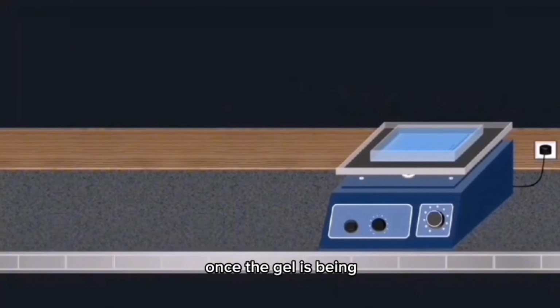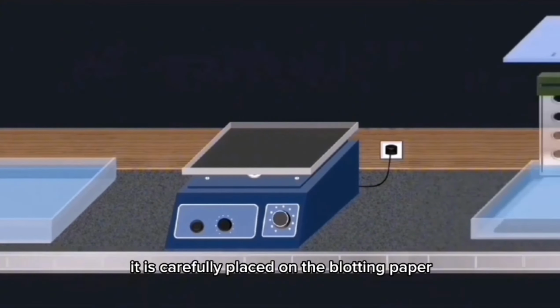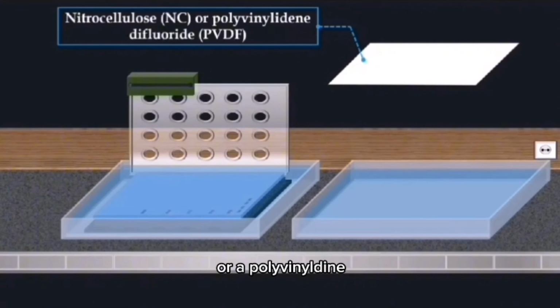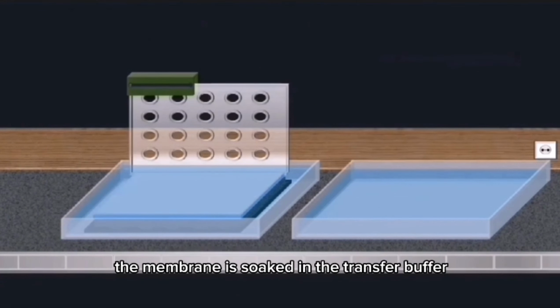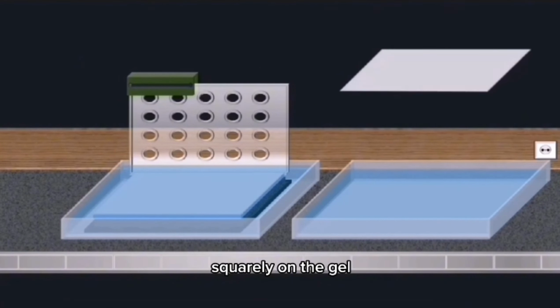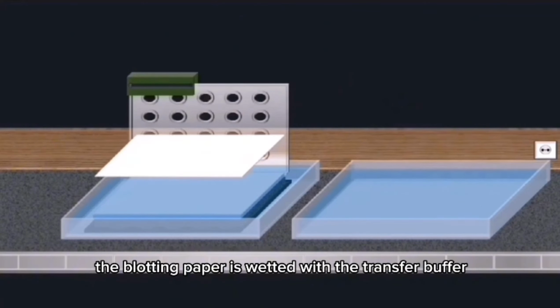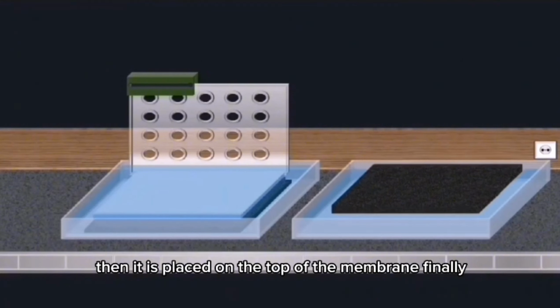Once the gel has been equilibrated in the transfer buffer, it is carefully placed on the blotting paper. For the transfer, a nitrocellulose membrane or a polyvinylidene difluoride membrane can be used. The membrane is soaked in the transfer buffer, then it is placed squarely on the gel. Next, a second sheet of blotting paper is wetted with the transfer buffer. Then it is placed on the top of the membrane.